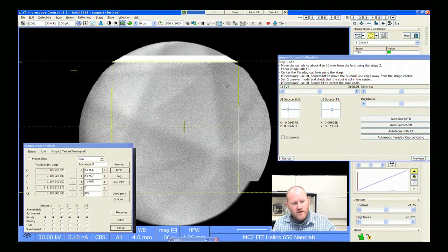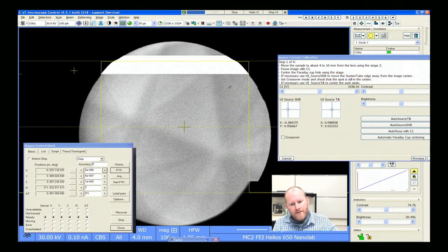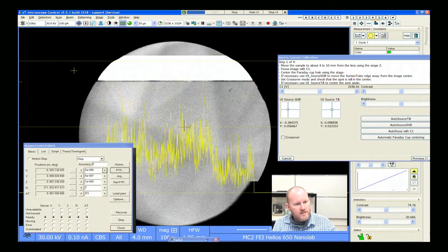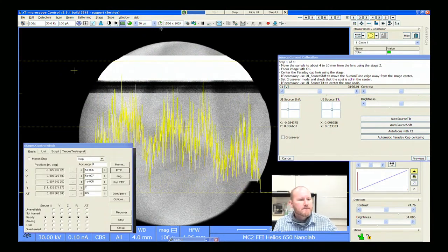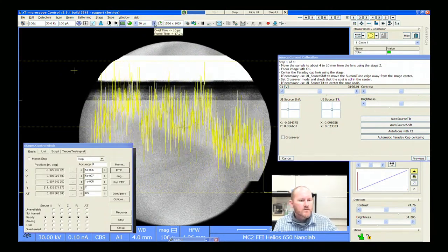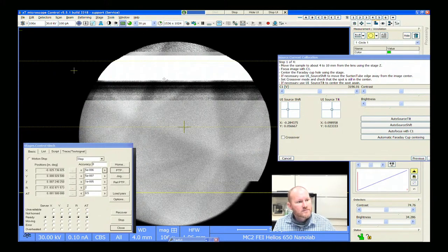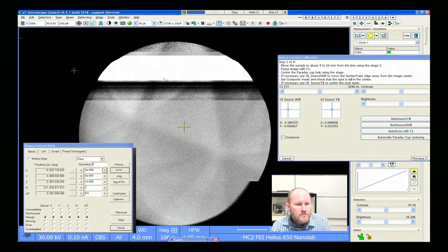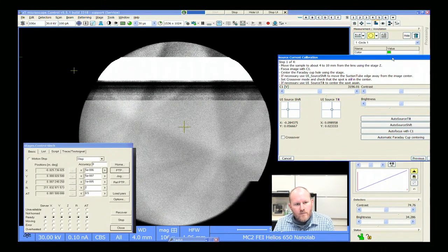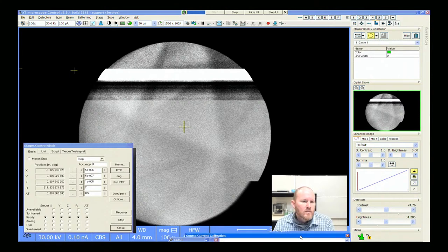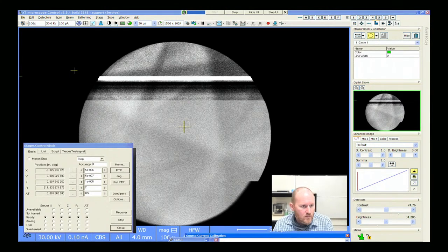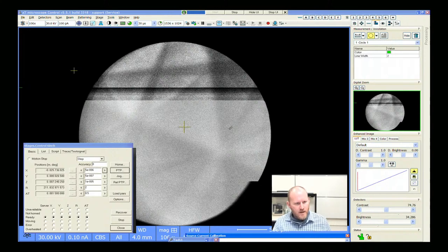I apologize — my sample I think just has some hydrocarbons on it. Normally you can create some really sharp patterns. We can also increase the contrast quite a bit, turn the brightness down, and scan a little slower.